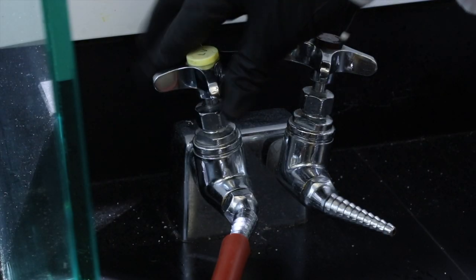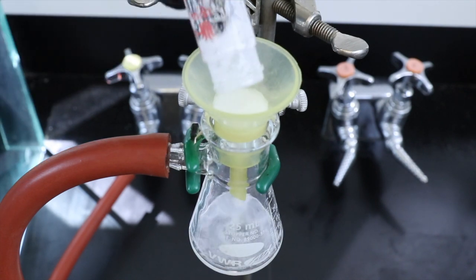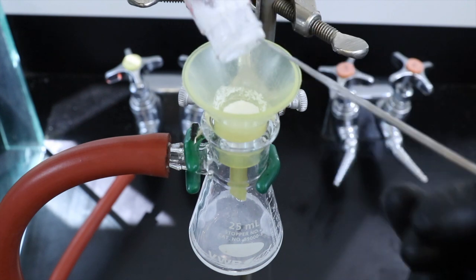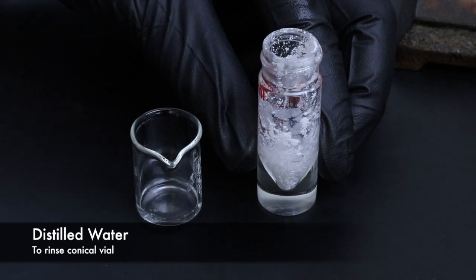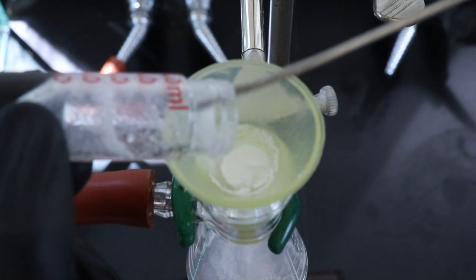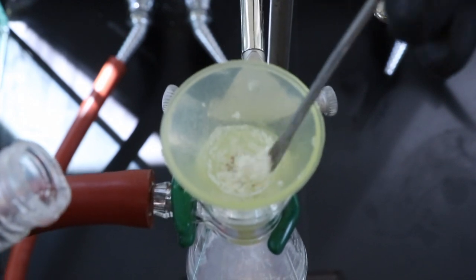I'll turn on the lab vacuum valve now, and you can see from the compression of this tube that the vacuum is working. So I'll pour the product into the Hirsch funnel and start separating it from the aqueous solution. I'll rinse the conical vial with some distilled water to help remove remaining product that was left over, and then I'll dump it into the Hirsch funnel. This will also help rinse off any ions or pull anything out that isn't the product.